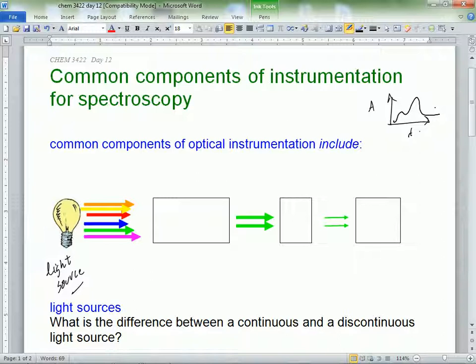They're going to use, starts with an M, monochromator. So the black box is the monochromator. It's not going to be a black box for long, so we'll take a look at it. Okay, so the monochromator does its job.